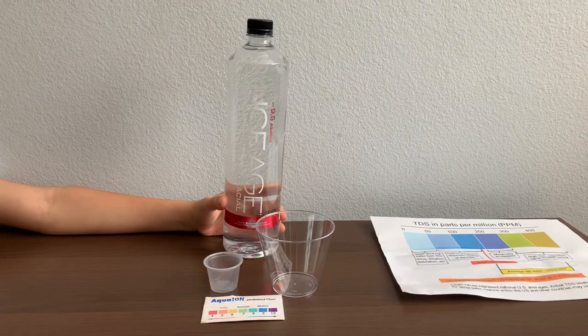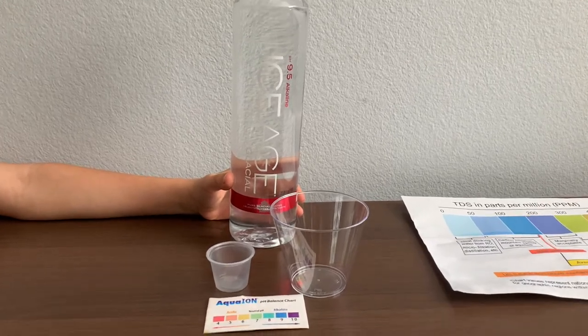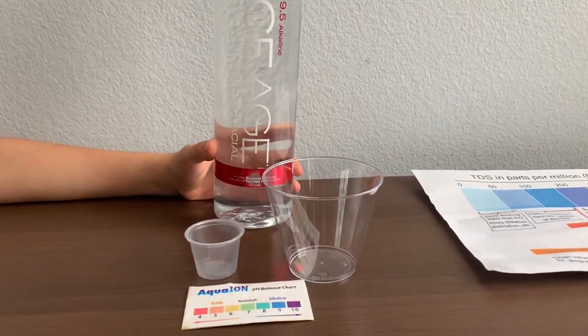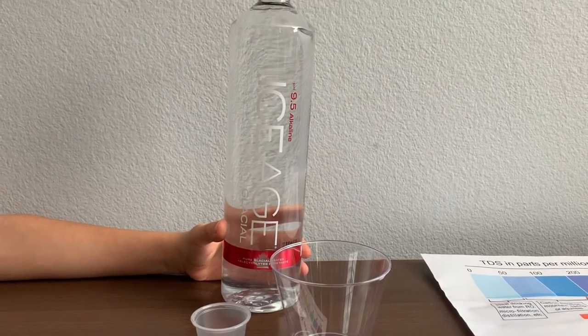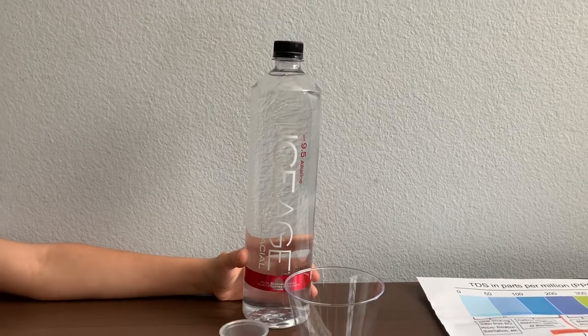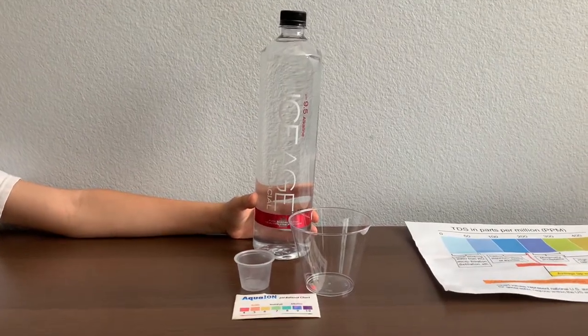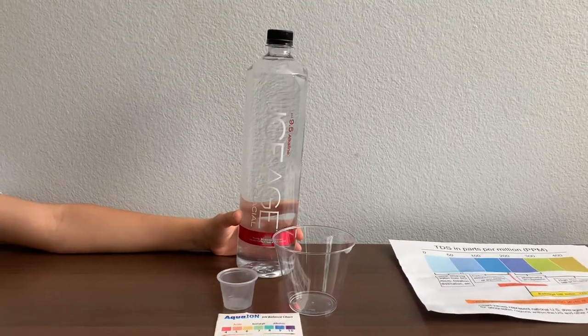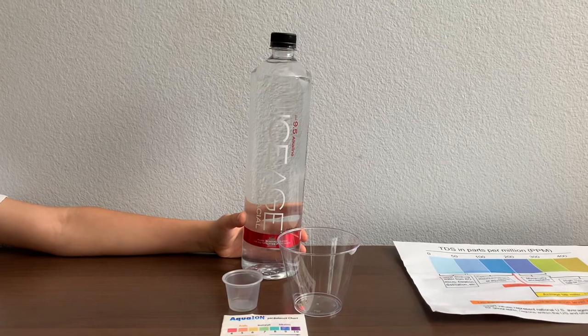This is Ice Age glacial alkaline spring water, infused with electrolytes for taste. Ice Age glacial alkaline is sourced from the coast mountains of British Columbia, Canada. The pH balance is supposed to be 9.5. We bought it at Lucky Market in San Francisco for $2.29.